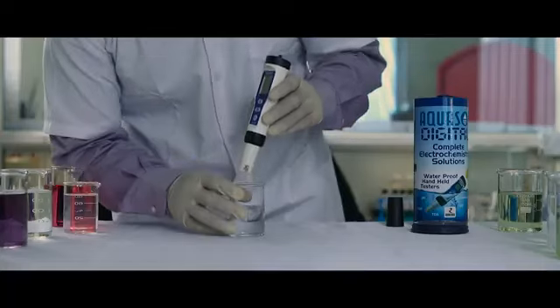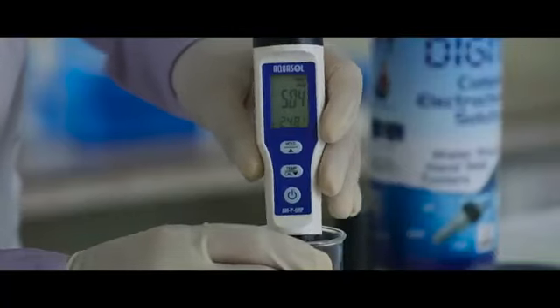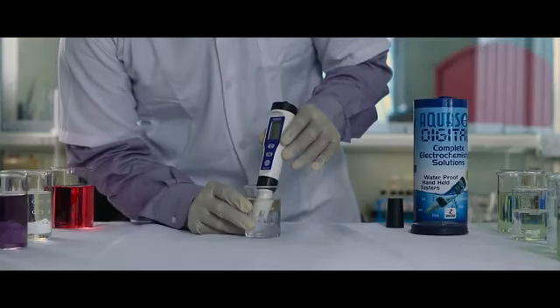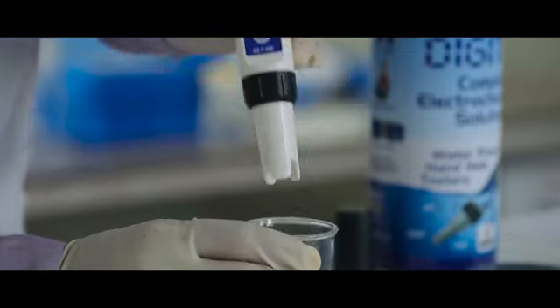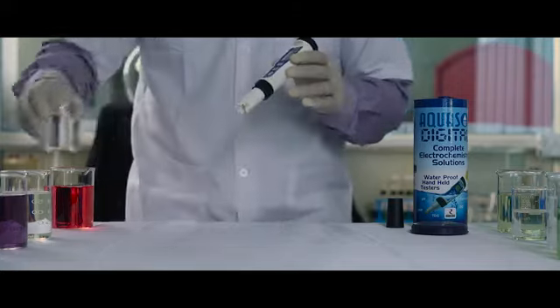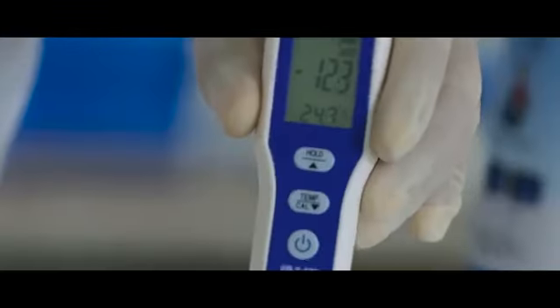We can start the test. Dip the electrode in the sample solution. Stir gently for a stable reading. Note down the ORP of the sample. You can also measure the value of a negative sample.